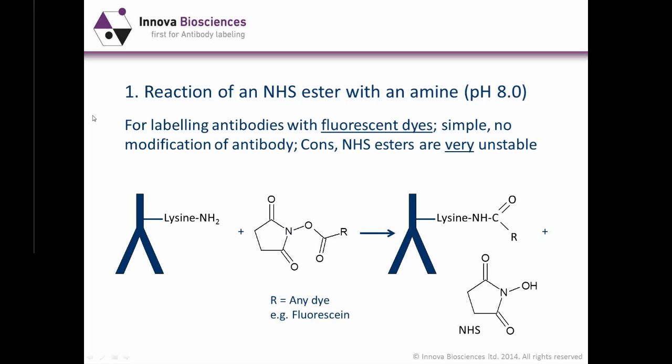And for those who are interested in the chemistry, here's the antibody with a lysine with the terminal amine. This is the NHS ester here, and R represents any dye, say fluorescein. But this could be more or less anything, and this part will be constant.